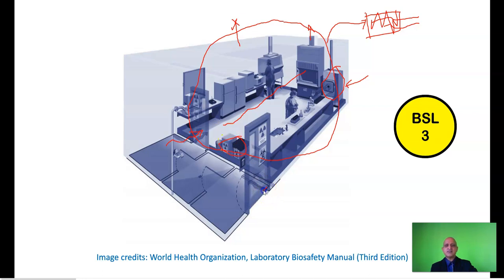However, you will note something at the entrance. This is the vestibule. It can be in the form of an airlock. So ideally, you'll have your door with your signage, and for biosecurity reasons, you may have a security protocol in the form of this keypad for signing in or using your thumbprint to access this facility.